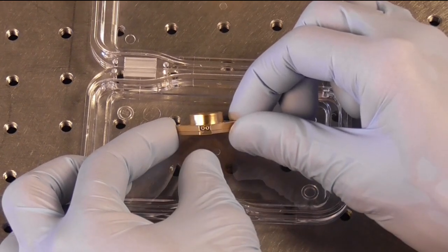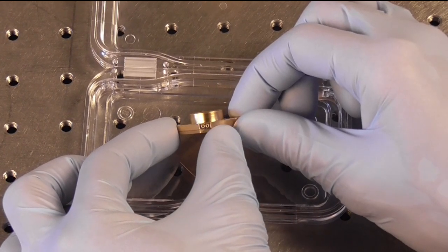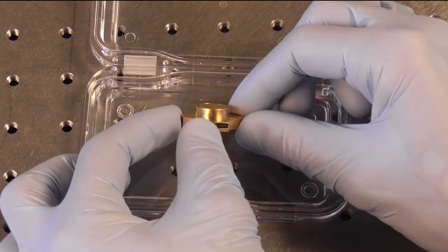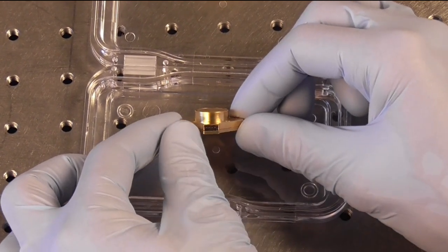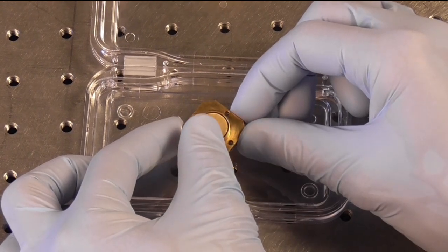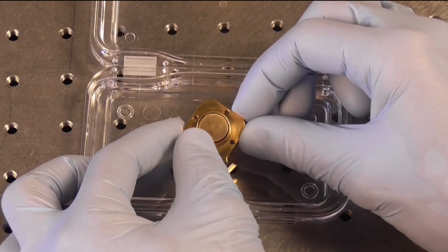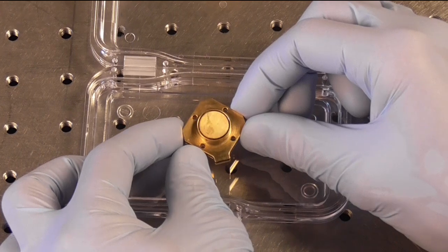On the side you see a two-pin connector that goes to the solid state heating element of the Agile Temperature Stage. And here you see a four-pin connector that goes to the CERNOX that measures the temperature exactly 500 microns below the sample platform, which gives you very good control over the temperature.